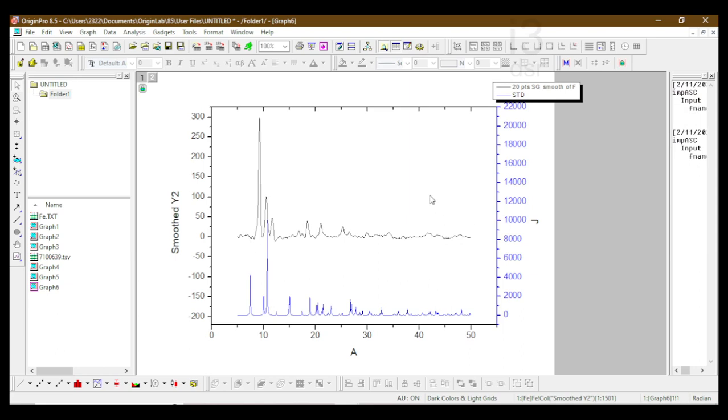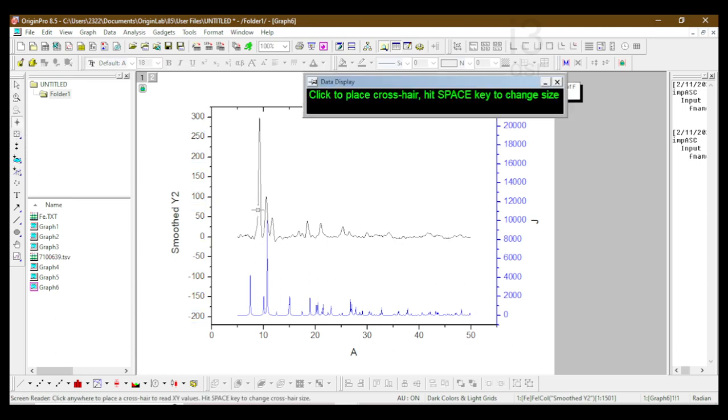So this is here and this is above. I have just adjusted the scale. Now the scale is no longer valid because we are just comparing the intensities and the peak position. Now we know there is one peak corresponding here and there are two other peaks which are corresponding here, and we could see that this is screen reader.